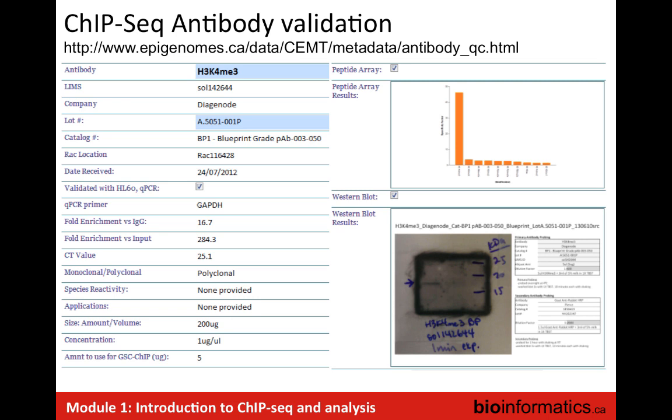Typically, I think we're running paired end 125s now, just because that's the way the reagents are kitted. But paired end 75s would be more than sufficient for most applications. However, if you're interested in such things as transposable elements, you'd want a little bit more, like paired end 125s will be useful. And that's another feature of paired end reads. When you're looking at repetitive sequences, you can anchor one read in the unique part of the genome and the other read can drop into the transposon, and then you can actually distinguish between different repetitive sequences. So again, I think it's a vendor issue.